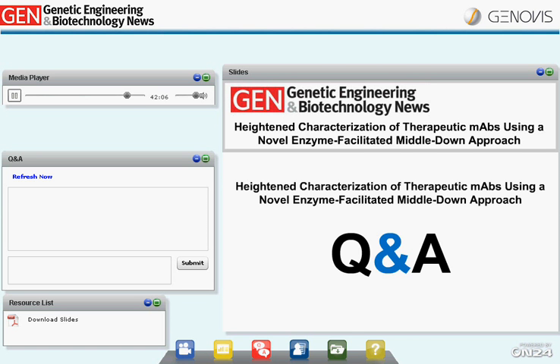First, we removed the N-glycan, whittled it down to the core GlcNAc with or without the fucose, followed by the FabRICATOR digest. And the goal was to reduce the heterogeneity in the single-chain Fc that's associated with the N-glycan. That approach allowed us to do more gas phase characterization using electron transfer dissociation on the Bruker ultra-high-resolution mass spec.